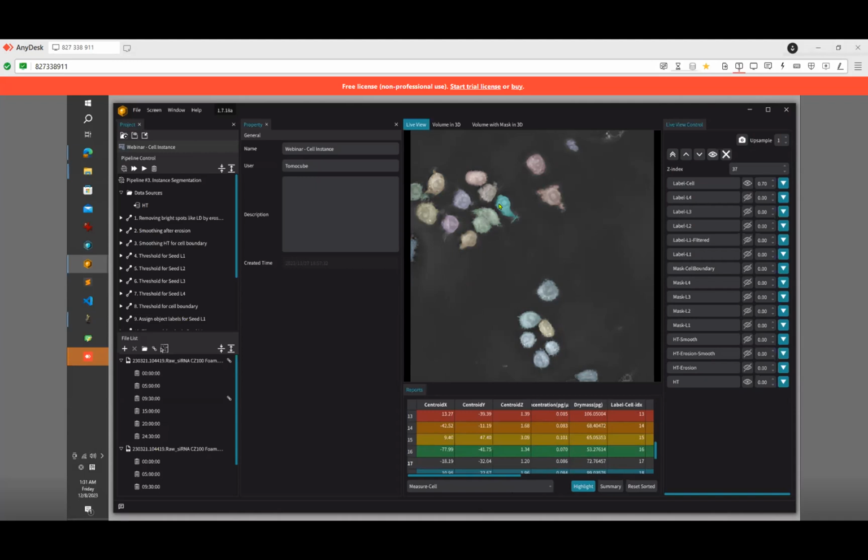So if you look into the label image, then you may understand what the label data means. So you can easily identify the objects by numbers. If you import the data in, for example, ImageJ, there is a number, and you can identify those objects by the colors or any kind of method.